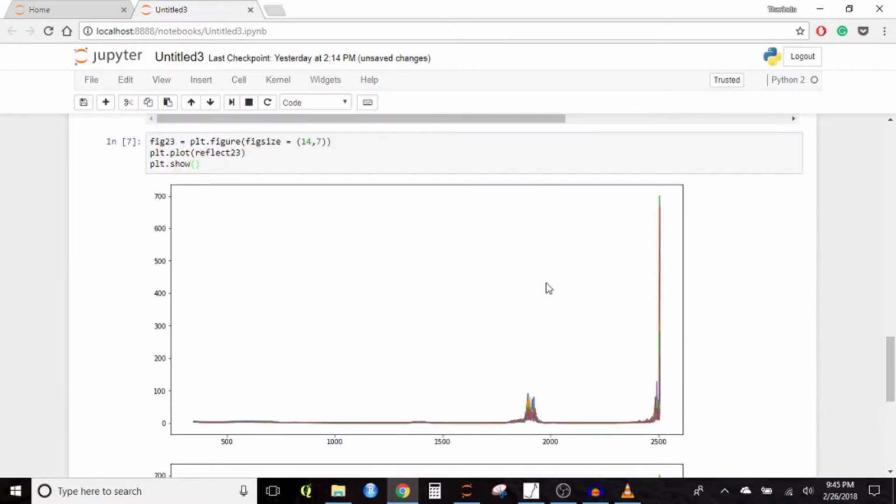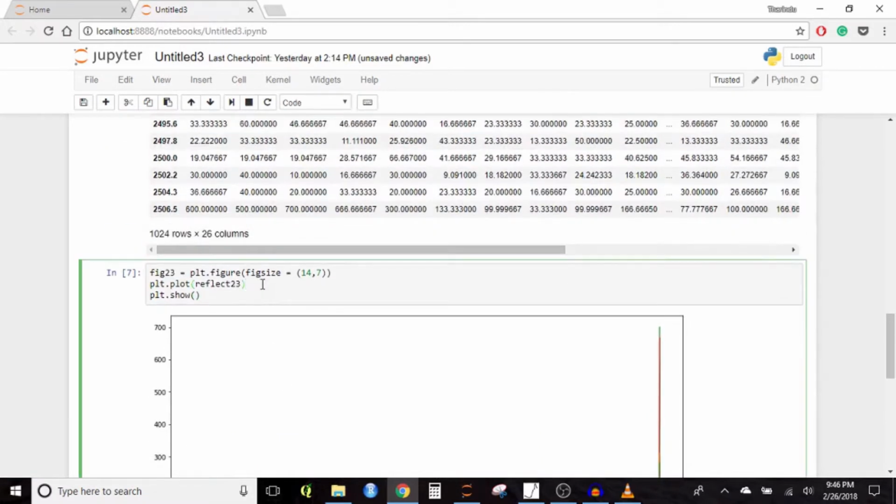All right. So we're going to have to work with this a little bit. First off, we're not really interested in anything too far beyond 1000 nanometers. So we can go ahead and restrict the x-axis and restrict the y-axis. So let's make that our next step.